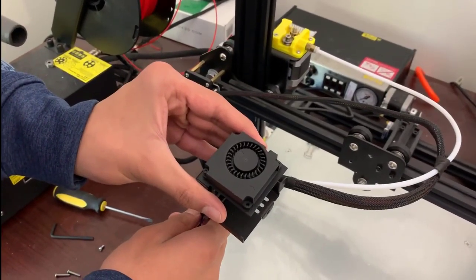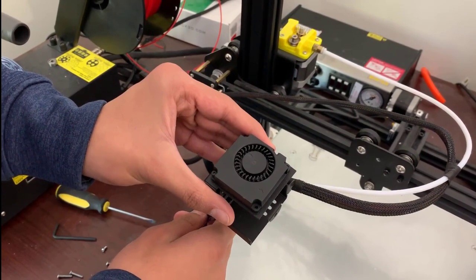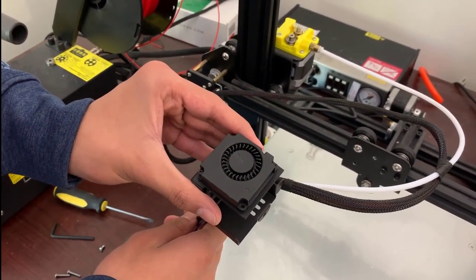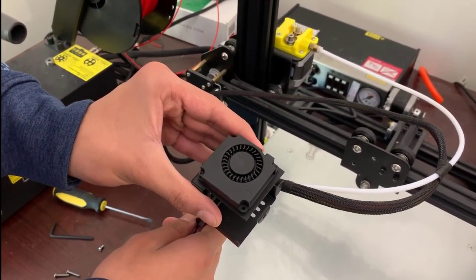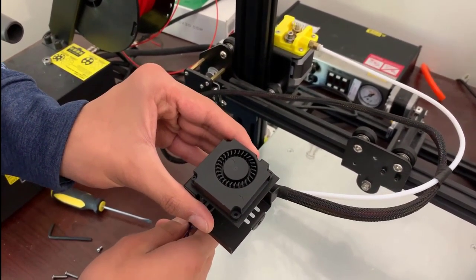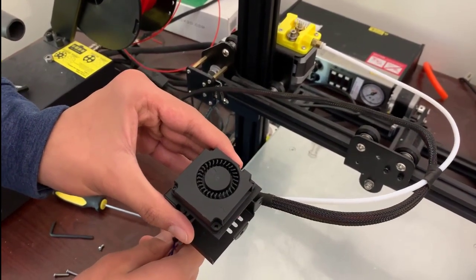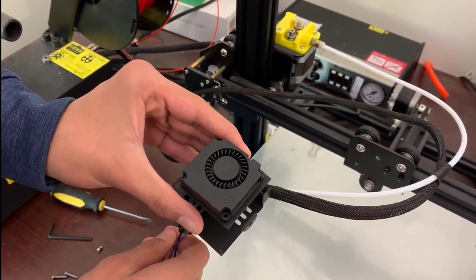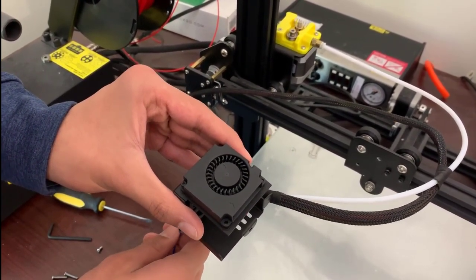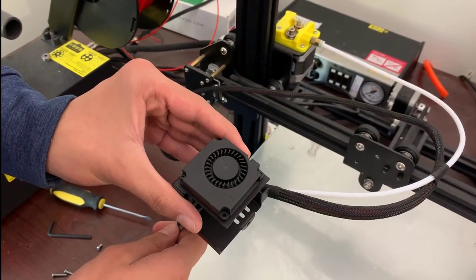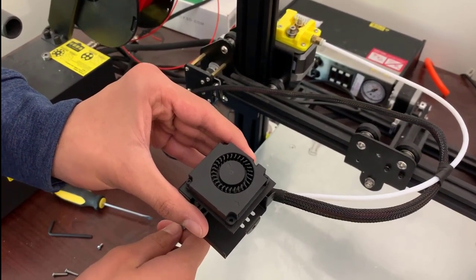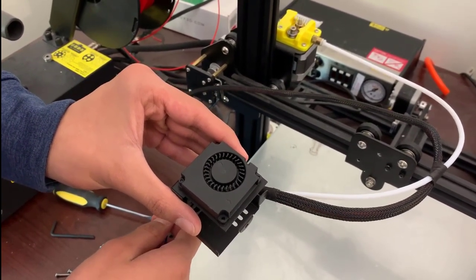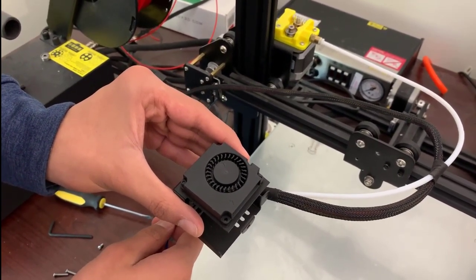So now that you've removed the actual extruder head, we're going to be removing this fan from the casing surrounding the extruder. Now we are doing this because we are going to be powering our extrusion based system off the fan. So we are going to be using leads to connect the actual fan motor to our extruder system.